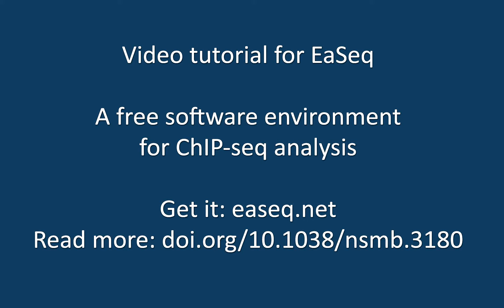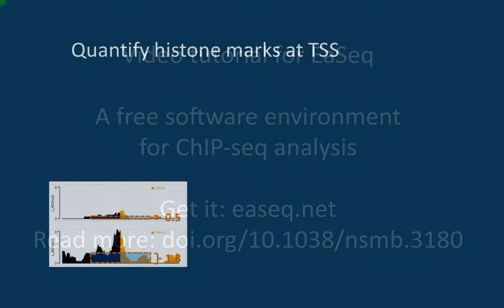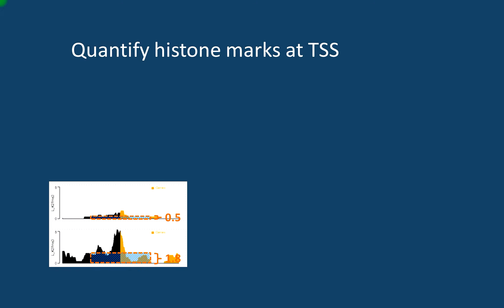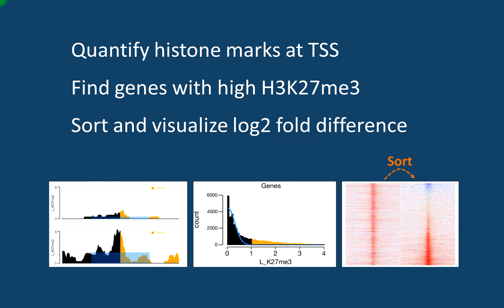Hello and welcome to this ESEC tutorial. Here I would like to show you how to quantify histone marks at the transcription start sites, as well as to identify a set of genes with a particularly high level of one of the histone marks, and sort and visualize them according to the log twofold difference of another set of histone marks.